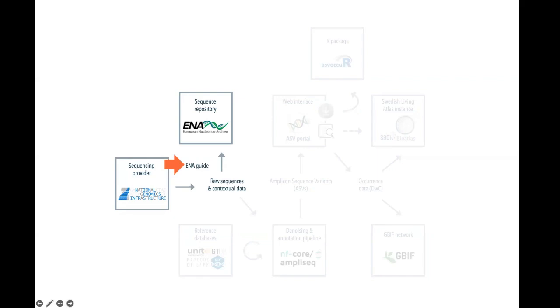So just to reiterate what Anders said, you should note that SBDI will not store your sequence reads, but we do provide a guide on how to archive them with the ENA. And I'll just start by showing you how to find this guide.